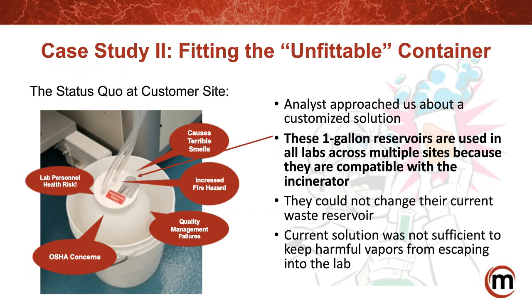So in the second case study, I visited a laboratory that had a very unique problem. In the picture, you see a container that is very prevalent across one of the largest agricultural and industrial companies in the world. I've also seen it at a number of other labs as well, very popular. It was a company-wide regulation that after filling their waste container with waste from HPLCs, the containers were to be incinerated.